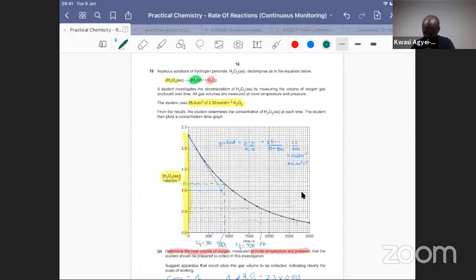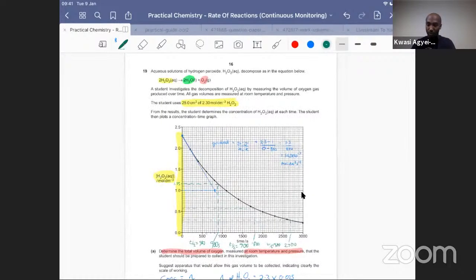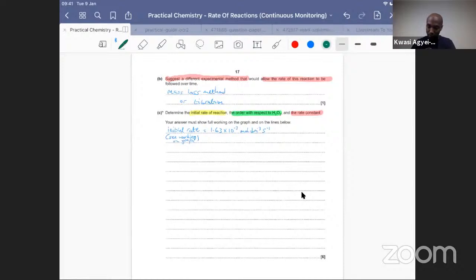Okay, so that's now taking us to 2,700 seconds, and again, T half is equal to 900. Okay, so we've got a constant half-life in this reaction where you've got hydrogen peroxide decomposing. So we can write down that T half is equal to 900 seconds.